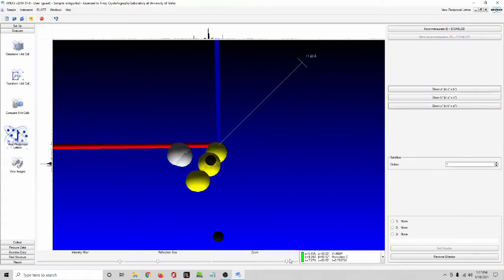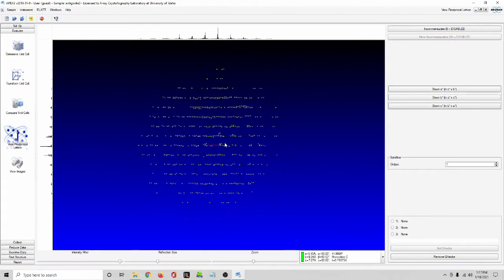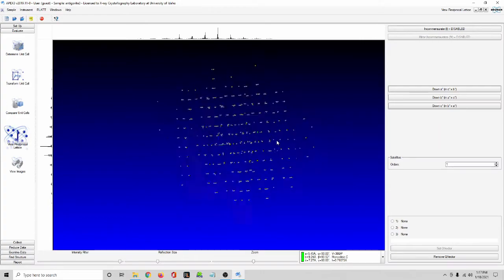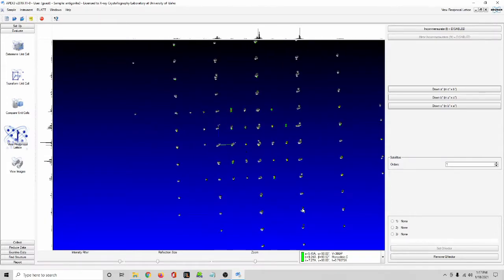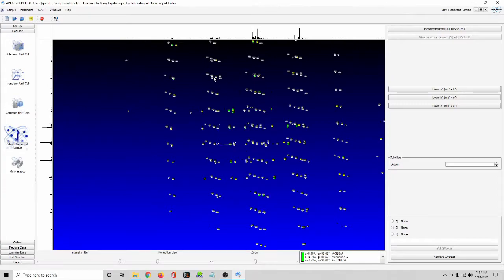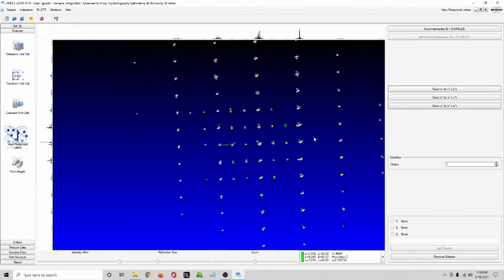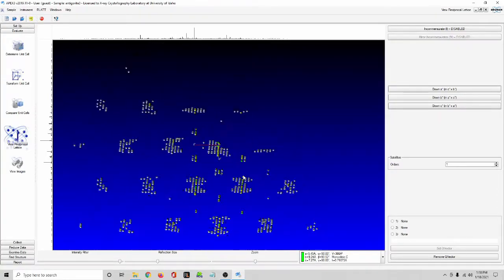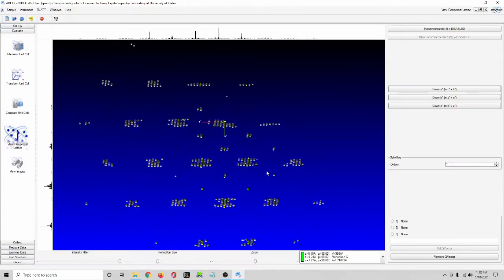Commensurate back to the normal mode. Still probably some twins. Not as bad though. So clearly that helped quite a bit, because now, I mean, I see those up there, but there's some here and there, but this is much better. So I'm going to assign more reflections to the sublattice. So what are now our yellow group here, and I'm going to move this up.